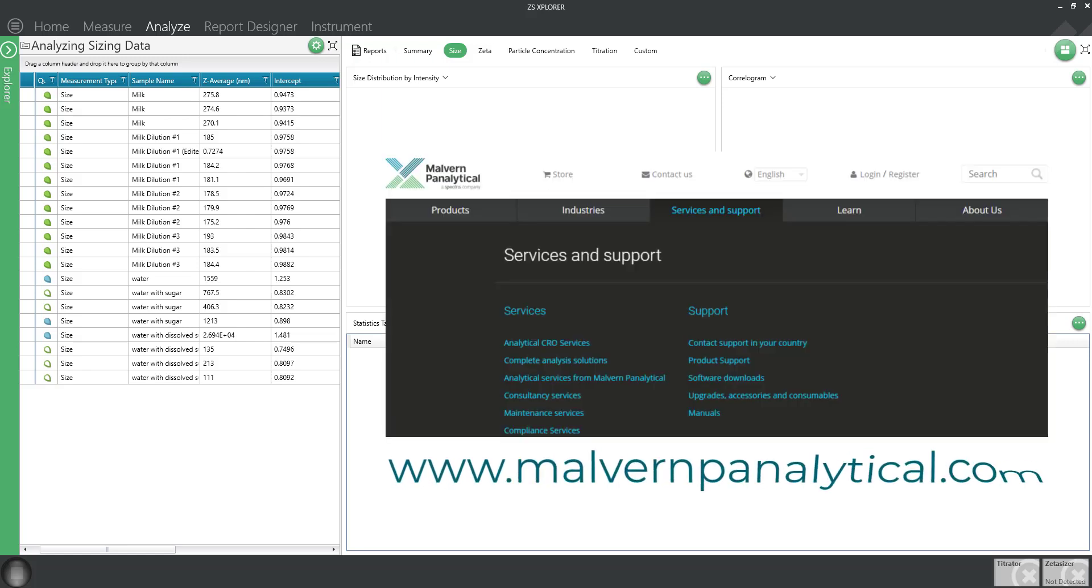Since the ZS Explorer software is readily available from our website, you can easily install the software on multiple computers for transferring the data and collaborating on projects.